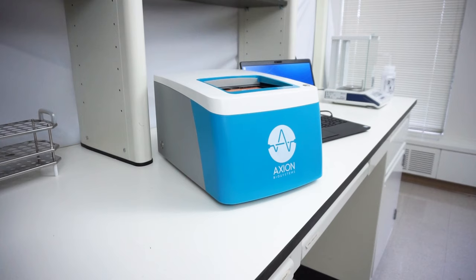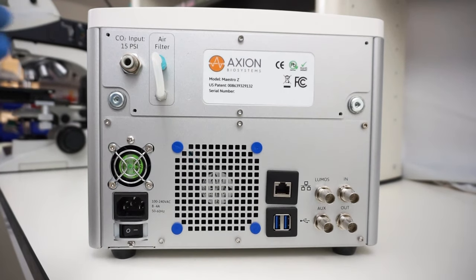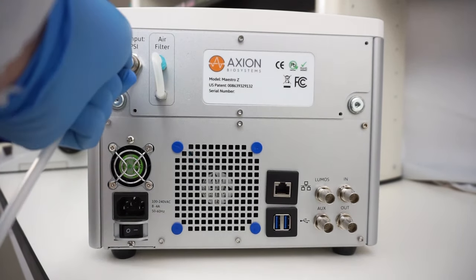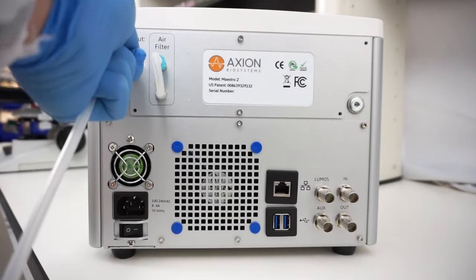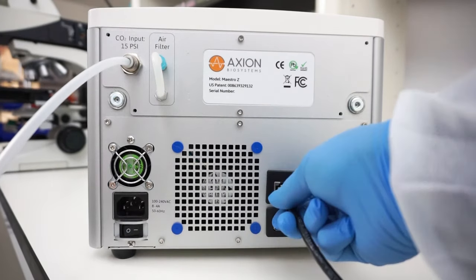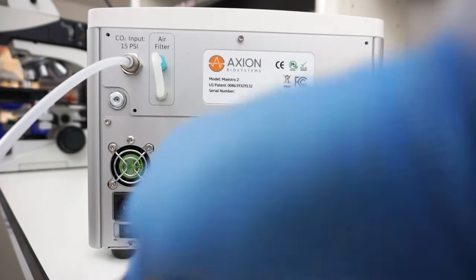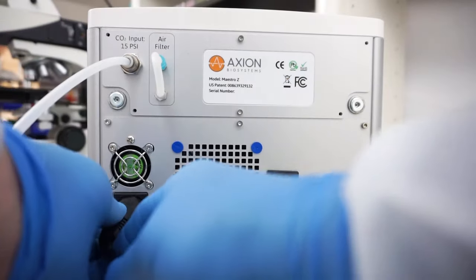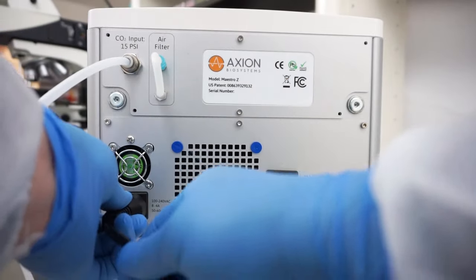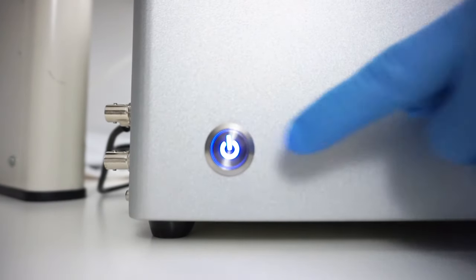Maestro Z is a benchtop system with a built-in incubator. To get started, simply plug your CO2 line into the back of the Maestro Z, connect the Ethernet cable for data connection, plug the power cord into an outlet, and turn the system on. That's it!